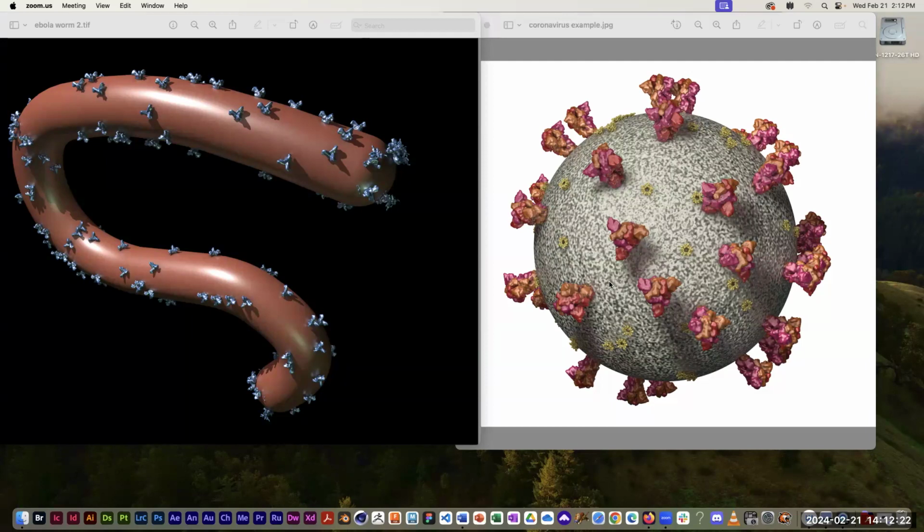So that's what we're going to focus on today, accessing the raw data from cryo-electron tomography and figuring out how to then convert that data into some format that's usable in a graphics program. And just in a nutshell, I'm going to introduce you to a new application called Chimera X, which we'll use quite a lot for the rest of the semester, because it's also a very useful program for looking at molecules, molecular structures. But one big advantage that Chimera X has is that it's also a great program for viewing Cryo-ET data.